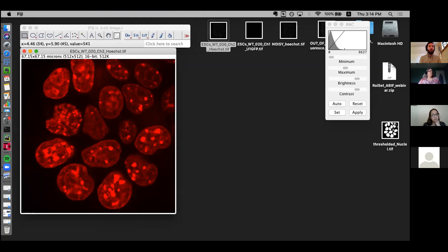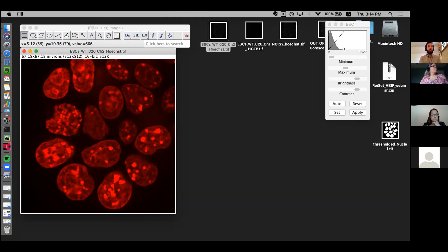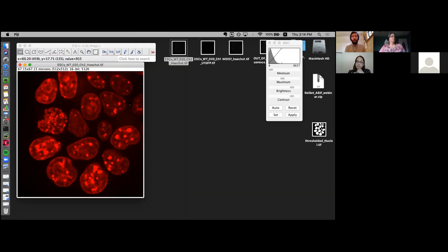If you bring your mouse over the image, you can see a few numbers changing on the main Fiji window at the top. You can see x has a number, y has a number, and there's a value. This is simply the XY coordinate where my mouse currently is. The value at the end is the pixel intensity value — a readout of how many photons were detected by that pixel on the camera. Brighter things have a higher intensity value than dimmer background.